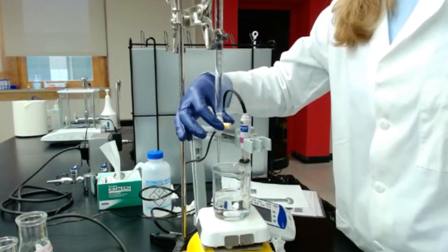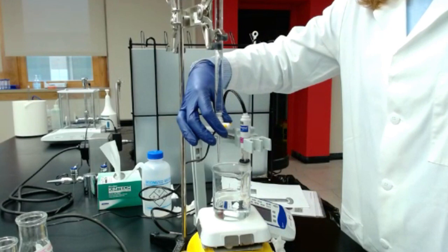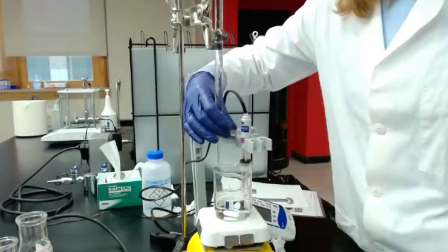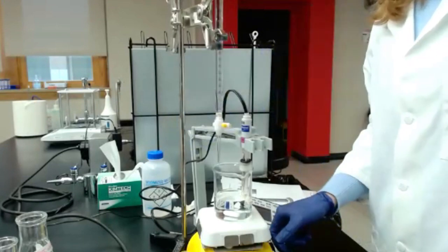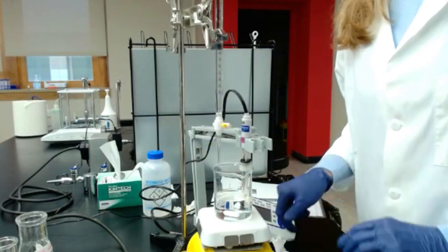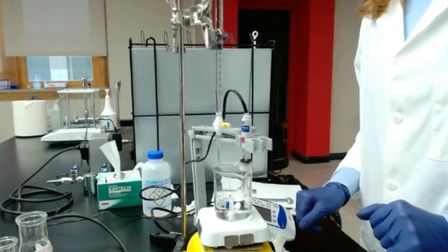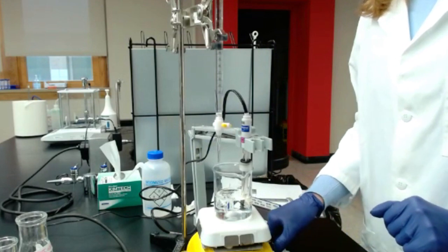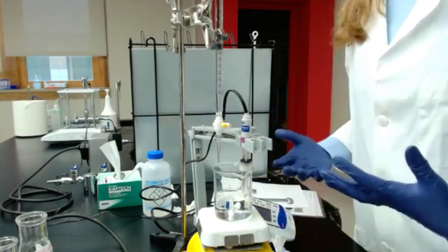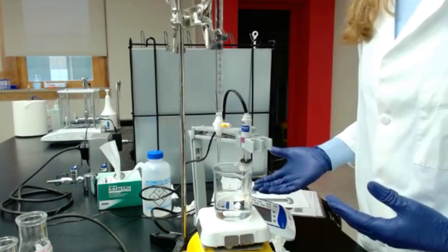With the tap, you're going to open slightly to make sure you have at least 1 drop that goes into your solution to get the pH of 8.2. That's really just to standardize. And once again, if you stir fast, it's going to bring some air, and that might provide an inaccurate reading.